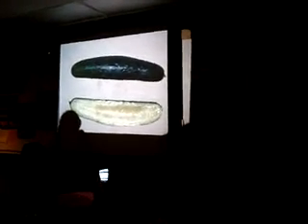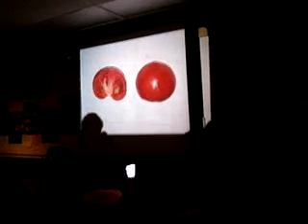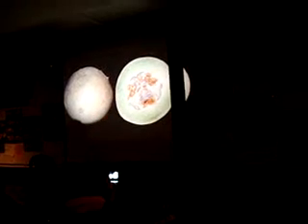What kind of fruit? Pepo. Okay. Somebody likes to say that. How about this? What kind of fruit? Berry. Berry. What kind of fruit? Pepo. Okay. And on the pepo, what part is this part? What part of the fruit? Exocarp. And then the lining in here? Endocarp. Okay.